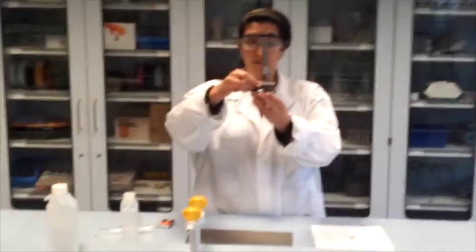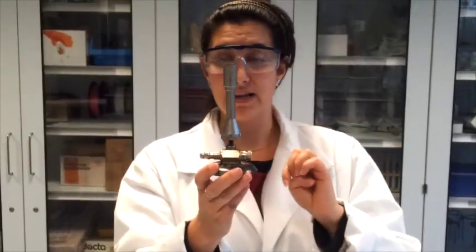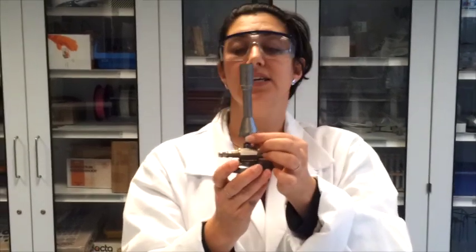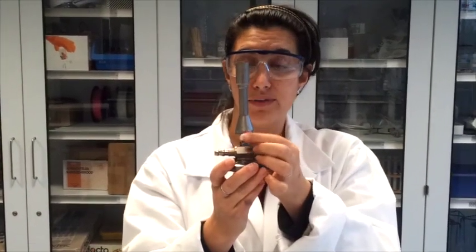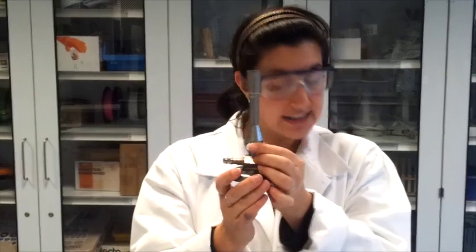Then we take the Bunsen burner. This is the barrel or the chimney of the Bunsen burner. This is the air hole that we can open using this regulator or thumb wheel.